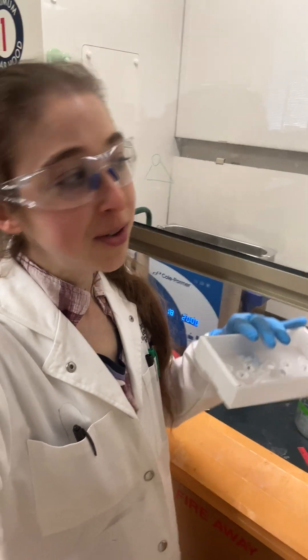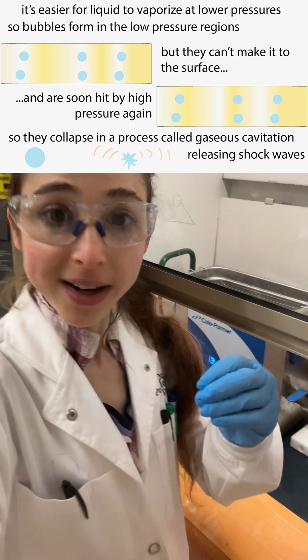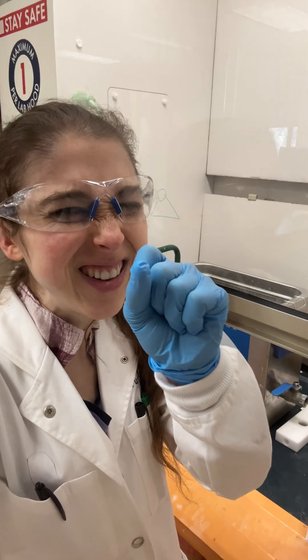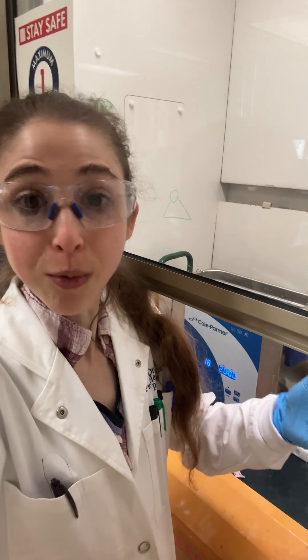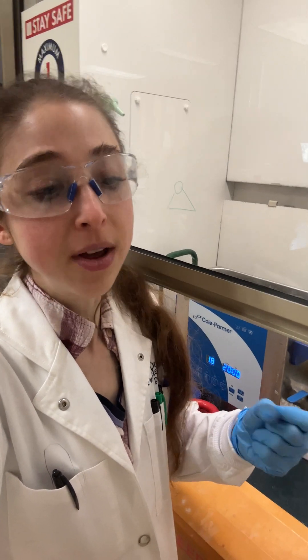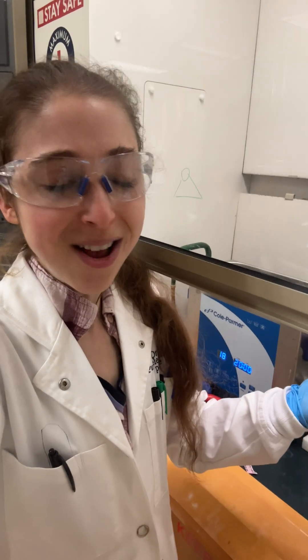If you're having trouble getting a solid to dissolve, you might want to try sonication. Sonication basically breaks up solids into really tiny pieces, exposing them to the solvents — like water or whatever other solvent you have — to help it dissolve, because it's the solute-solvent interactions that make things dissolve.